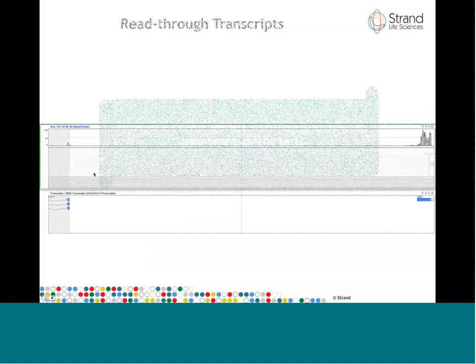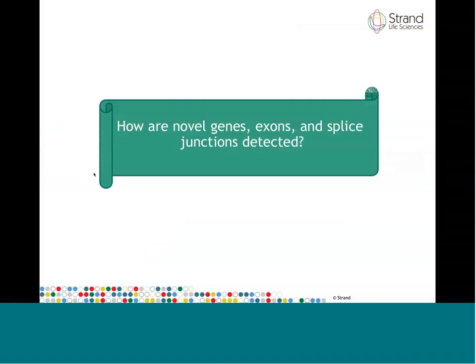The very last topic is how novel genes, novel exons, and spliced junctions are detected.